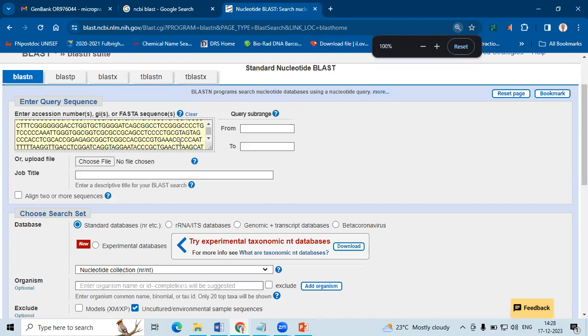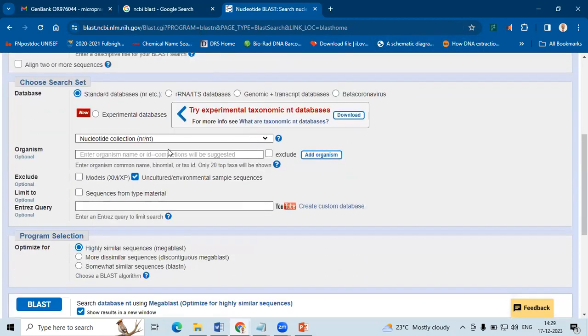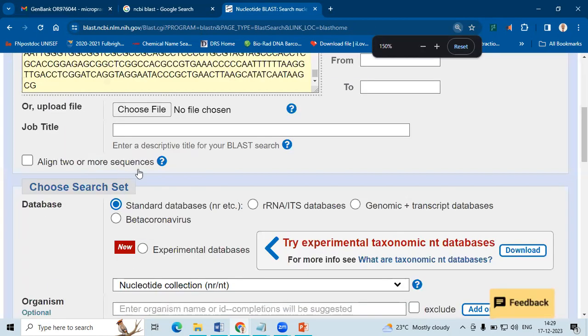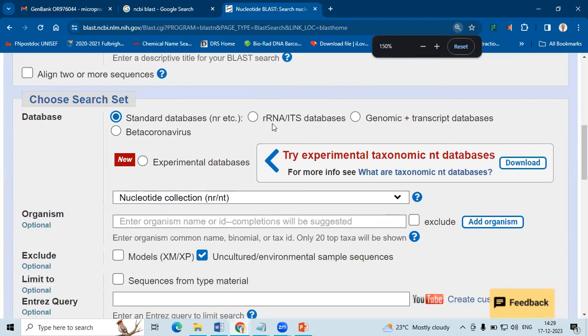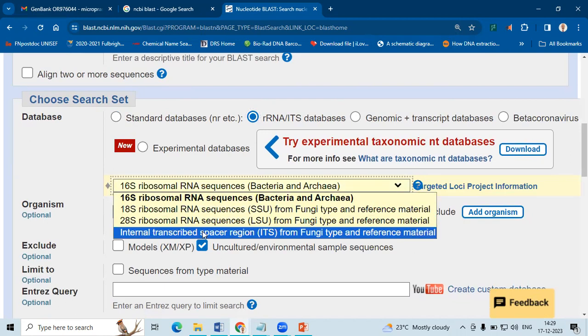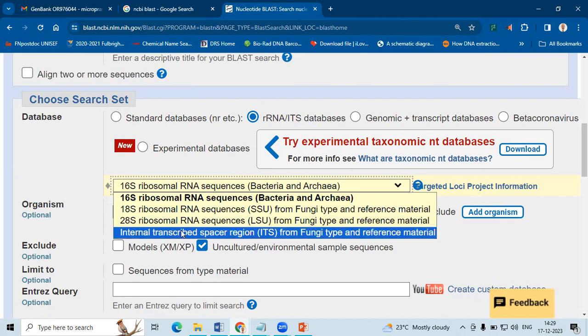After pasting it, just come down the page or scroll down. I usually go for standard databases. You may ask why not ITS databases, because we have ITS sequences. These databases are either 18S, 28S or ITS.